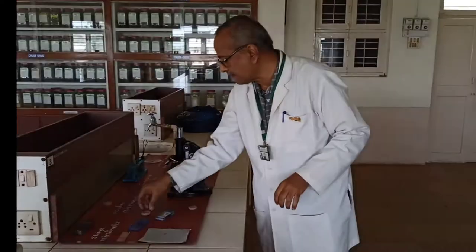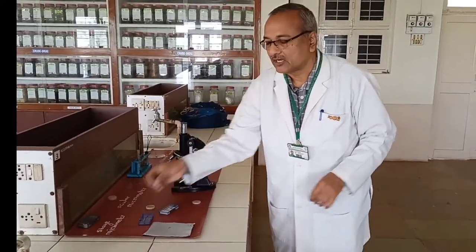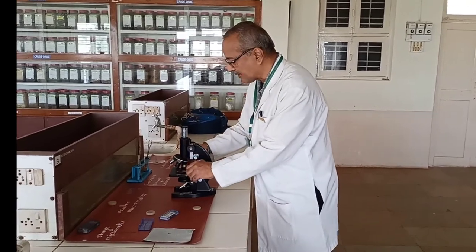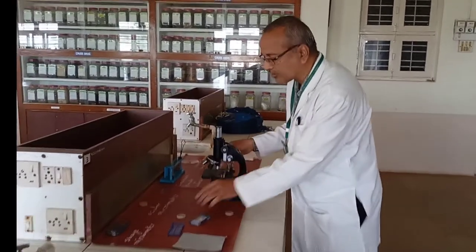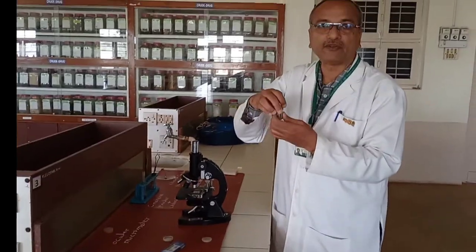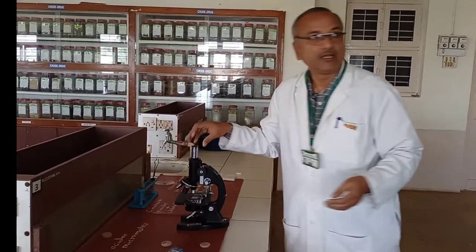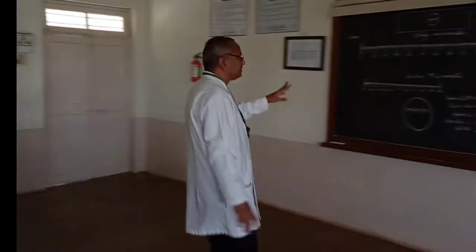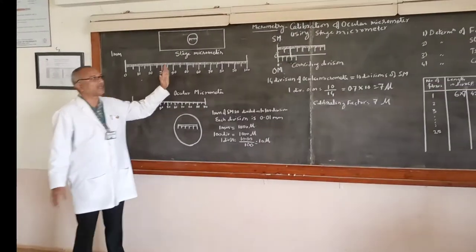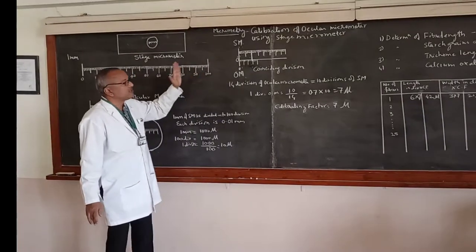The stage micrometer is to be placed on the stage of the microscope, and the ocular micrometer is to be inserted into the eyepiece of the microscope. Now let us come to the procedure — how we calibrate this ocular micrometer.